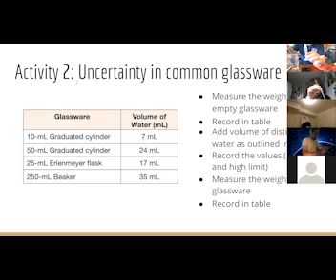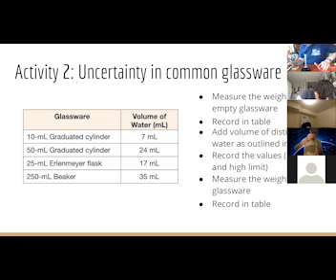All right, so now I'm pretty close to 7. So I'm going to get down to the level of my graduated cylinder and put in 7. There we go.